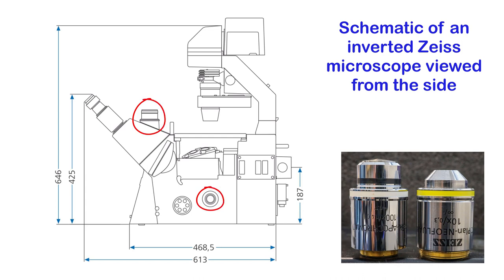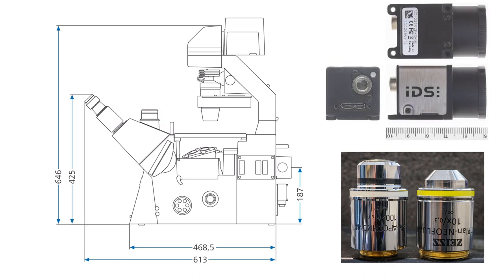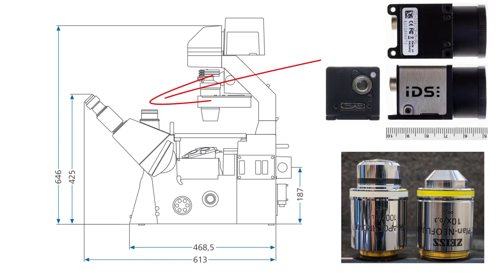We will use the one that is part of the trinocular head of the microscope. Our camera is a small USB camera shown on the right along with a scale that has units of centimeters.